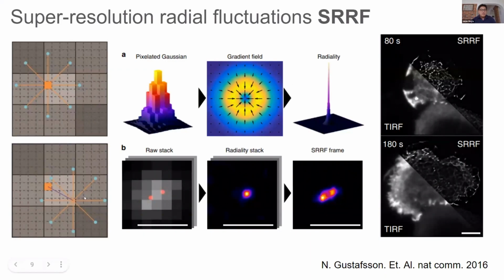When you do so, you manage to find the peaks, the local maxima in these regions, and then you assign with this criteria the new values that are created in the interpolation part. So that allows you 2 things: to select the local maxima, and since you have the local maxima and you have the radiality field, you can reduce again the full width half maximum of the Gaussian.